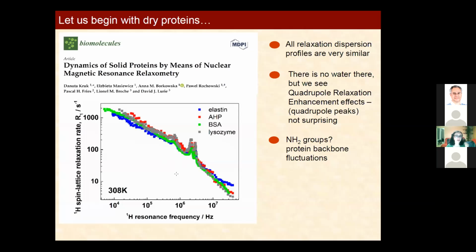Even if one asks whether there was some water, I can answer, if we have, I don't know, 0.05% of water, of course you cannot see water in such an experiment. You can ask to which extent the water affects the dynamics of the proteins, but this is a different question. It's obvious that the signal comes from the protons of those proteins. So, okay, they are similar.